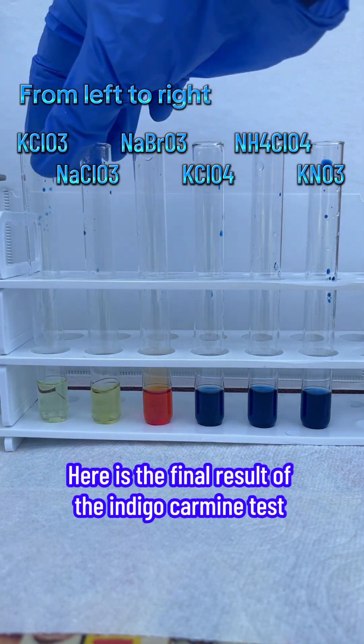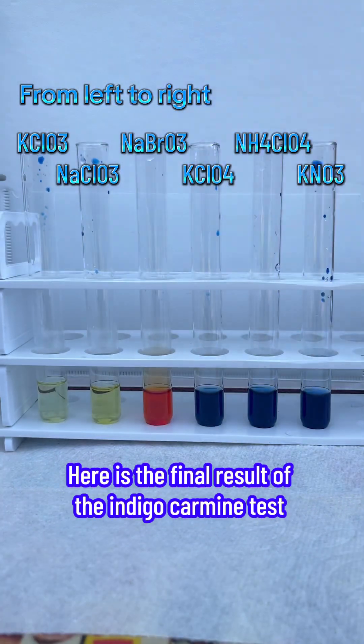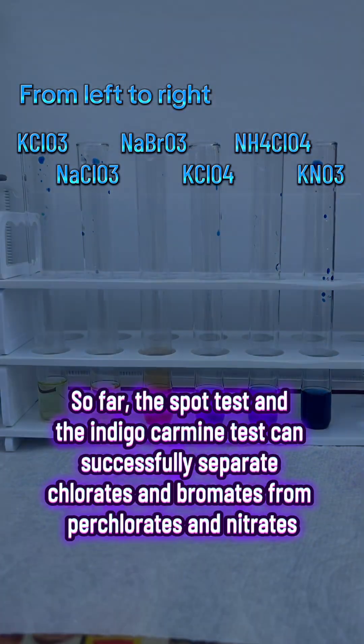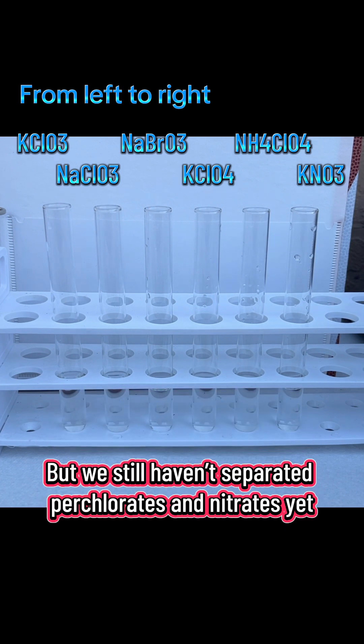Here is the final result of the indigo-carmine test. So far, the spot test and the indigo-carmine test can successfully separate chlorates and bromates from perchlorates and nitrates. But we still haven't separated perchlorates and nitrates yet.